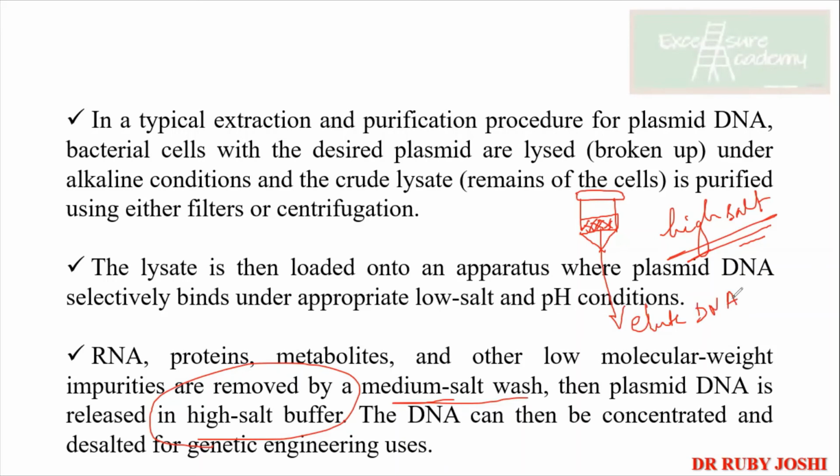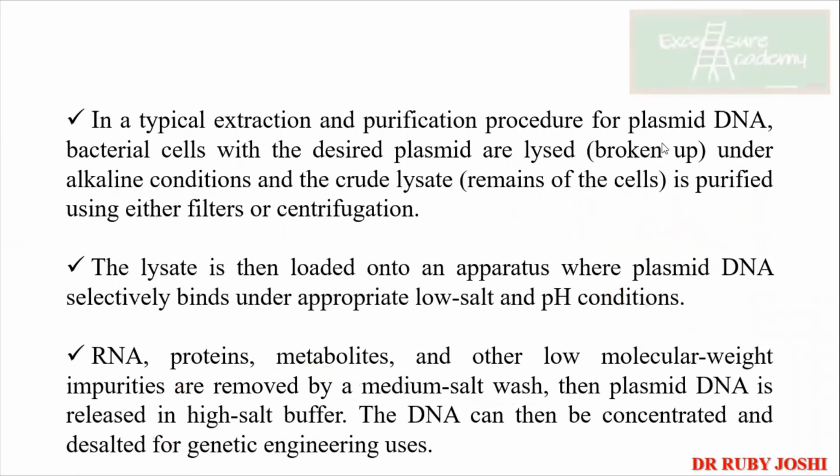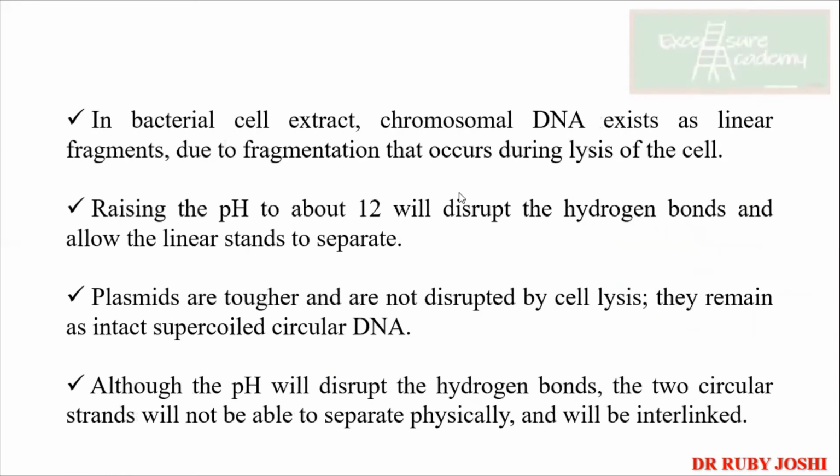Okay. Now the thing is that this eluted DNA is going to have high salt concentration, which is not good. If in future I'm going to do cloning, the enzymes will get precipitated out if I have high salt. So I will do the desalting. And for desalting, again, you have got different columns. So that is going to remove all your salt and only DNA will be present. Okay. So far, so good, guys. Able to follow? Yes, ma'am.